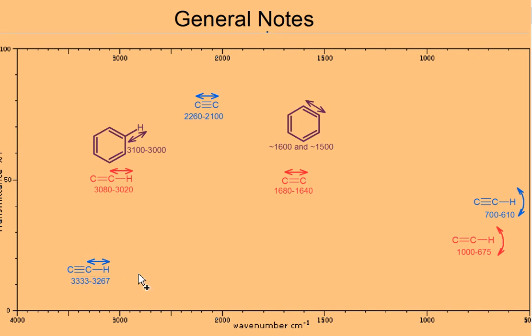We also have stretches for an alcohol, the OH bond itself, usually moderate to strong in the 3600 to 3000 range, so a very wide range. And usually it peaks at about 3300. And of course the main thing here is that the OH stretch is one of the broadest peaks we see. It looks like a huge big thumbprint on the left hand side of the spectra. We'll also see a carbon to oxygen bond ether link, like in the 1200 to 1000 range. It's usually one of the biggest peaks in this range, but of course it's difficult to determine below 1400. But if there isn't something there, then it might not be an alcohol.